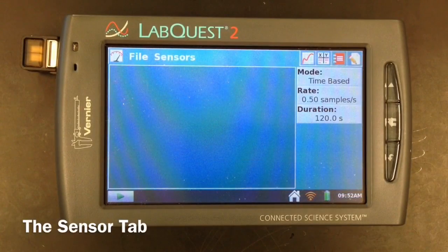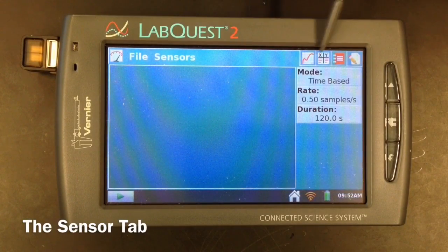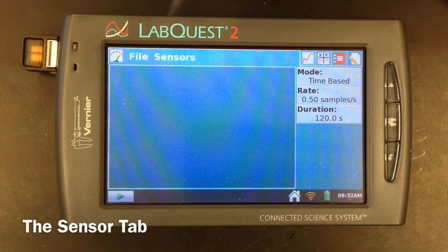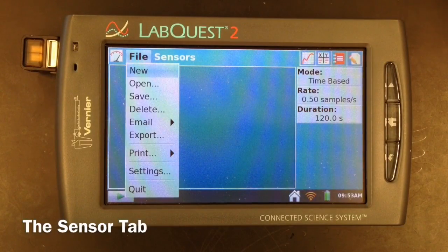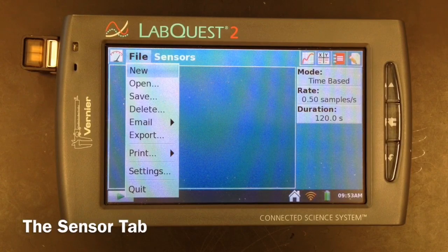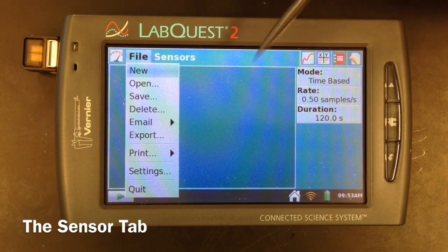Within the LabQuest app, there are five main tabs located along the top. Each one of these tabs will have a file menu, which has your standard options to start a new session, open previous data, save your current data, along with other various options to export the data that you collect out of the LabQuest.